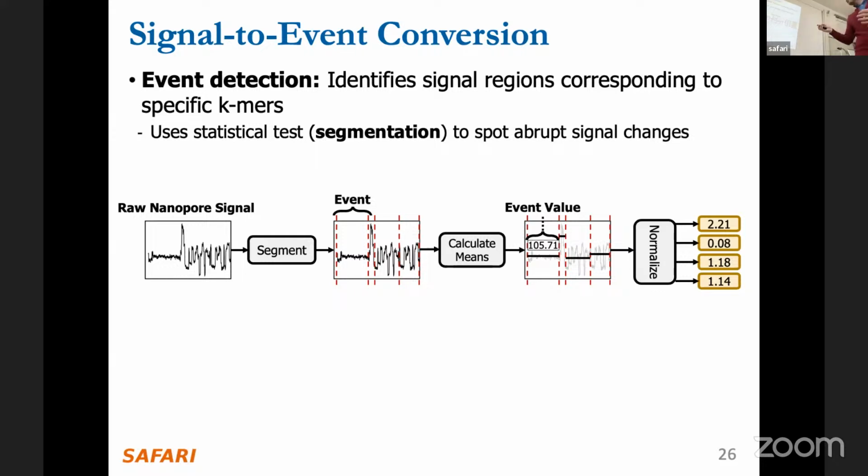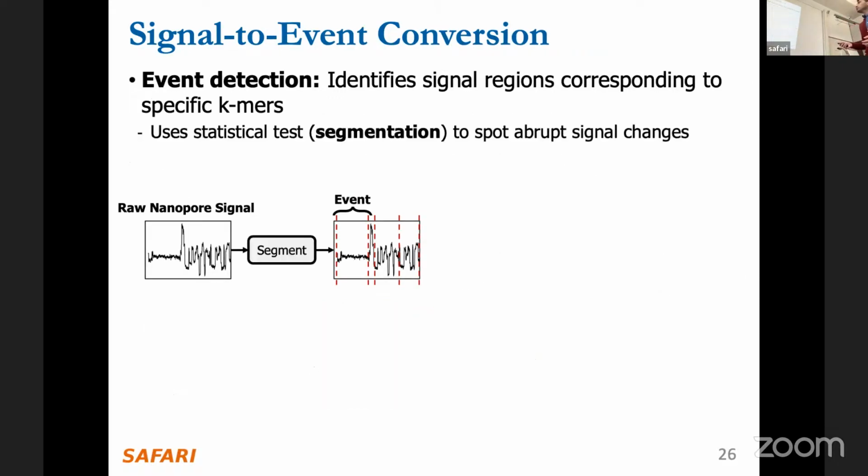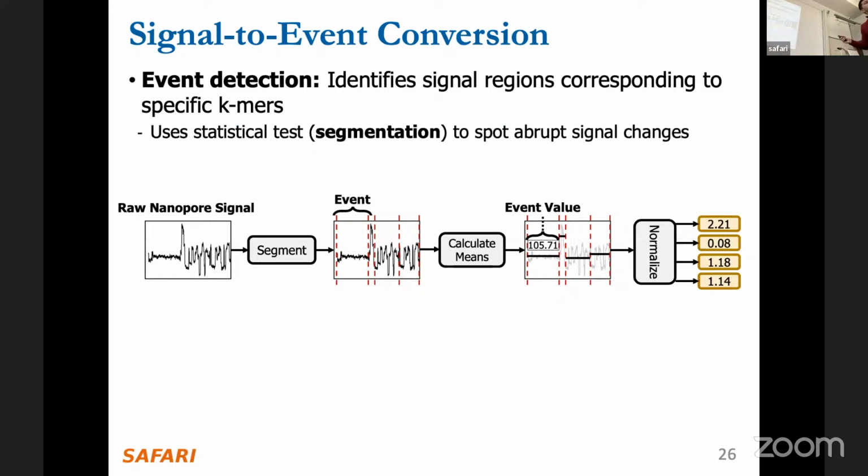But of course the computation is more sophisticated than simply looking up the k-mer. They moved from signal to k-mer, and then tried to match the k-mers from the signal to the k-mers in the reference genome. It's actually a good idea, but it turns out that you need hidden Markov models to accurately classify what sort of k-mers, and even then it's not very accurate.